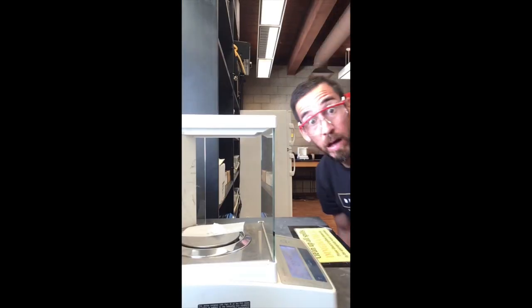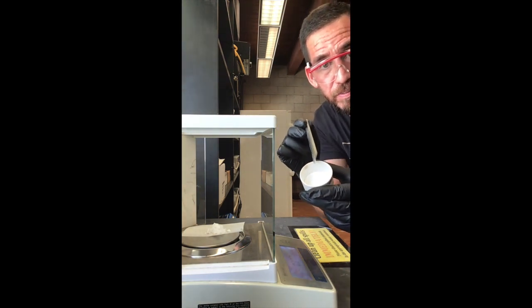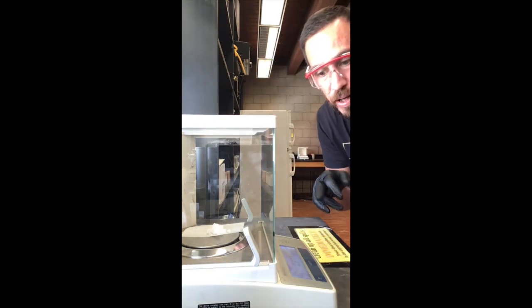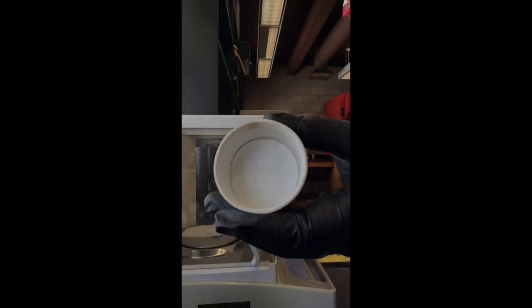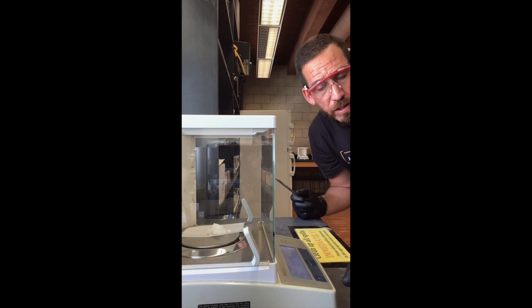Okay, so let's take a look at the mass of this final product of caffeine. Hello there. So basically, I scraped off this material, the caffeine from the Buchner funnel, onto this weigh paper, and what we've got is 0.377 grams of caffeine on there. You may or may not be able to see, but there's a little bit of caffeine on that Buchner funnel, and so there's some loss there, right?